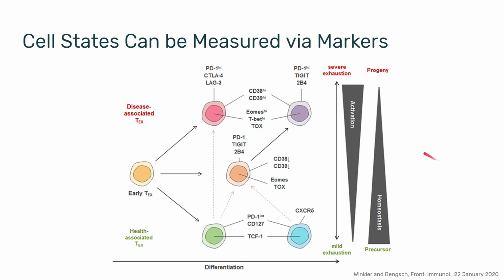Notably, PD-1, CTLA4, and LAG3 are garnering a lot of attention in the research community right now because they are indicators of cell exhaustion, which means that a T cell that expresses them is not currently active. Even if you see these cells, for example, within a tumor, they're not going to attack the tumor. And the underlying theme here is that using these markers, we can learn both what a cell is and what a cell is doing or going to do.